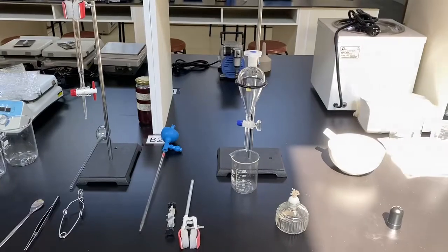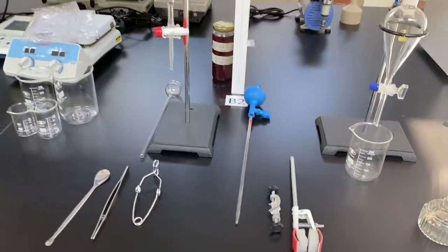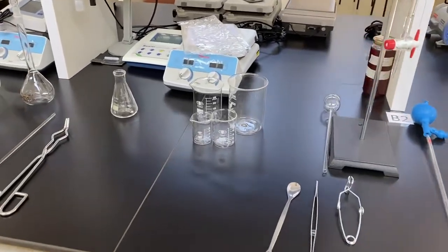Part 1: Glassware. A lot of the materials used in the chemistry laboratory are made of glass. These materials are commonly known as glassware. They are mostly used to contain, measure, or transport substances.